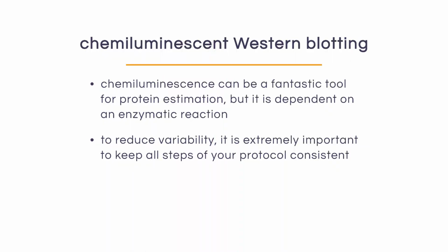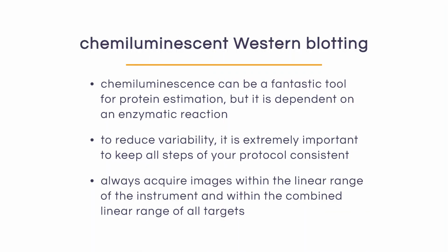To try and reduce the variability of this technique, it's going to be extremely important to keep all of the steps of your protocol consistent. That is especially important when it comes down to imaging your membrane, when you place your substrate, and when you acquire your image. By keeping those steps standardized and consistent, you're going to significantly increase the reproducibility of this technique. It is also extremely important that you acquire your images within the linear range of the instrument as well as within the combined linear range of all of your targets.